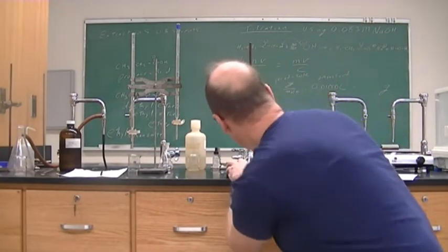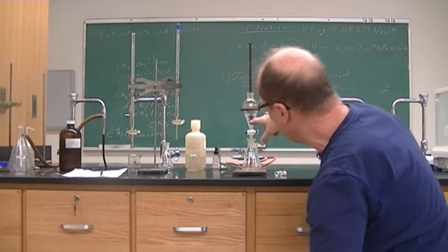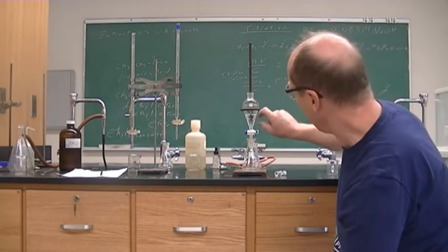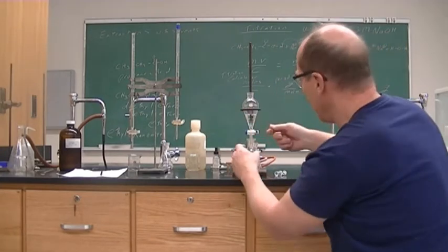Now you have to remove until the line of your water. This is an immiscible liquid. You have your polar hydrogen-bonded water, and you have your slightly polar ether, but they do not mix.